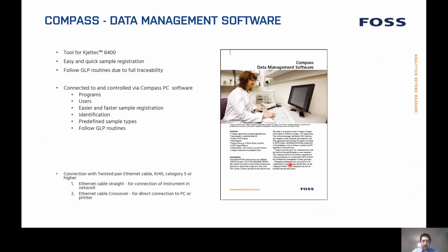Then you can get the LIMS export. And in the system, you can have all the program settings and the user settings. It's a faster registration procedure, and the complete system follows the GLP routines. So this is some basic introduction for the instrument as well.